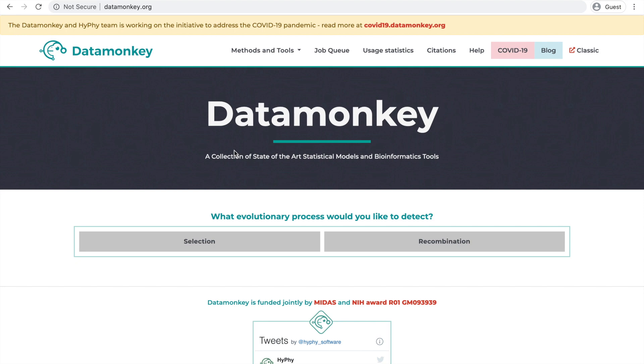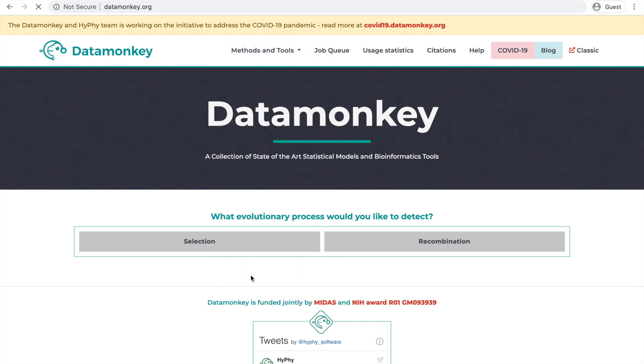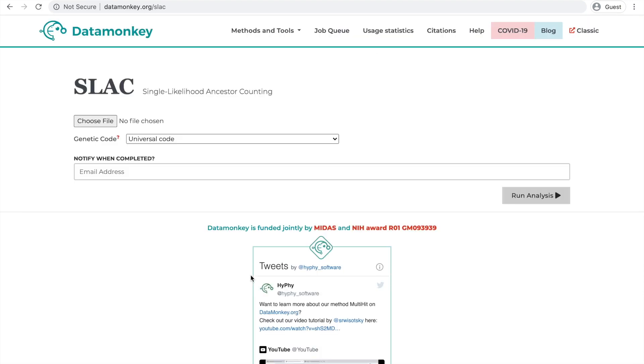To use SLAC, we can just navigate to the datamonkey.org page, click on the Methods and Tools dropdown, and select SLAC from the list.